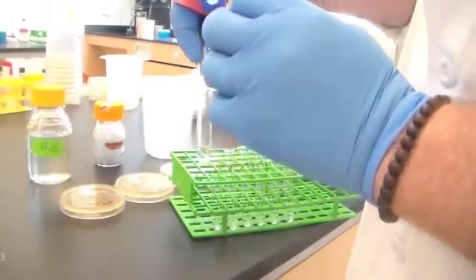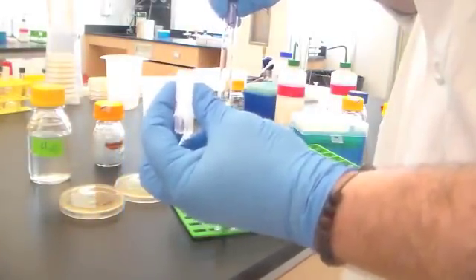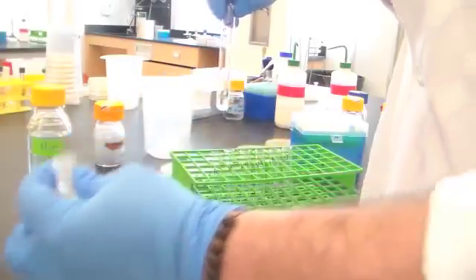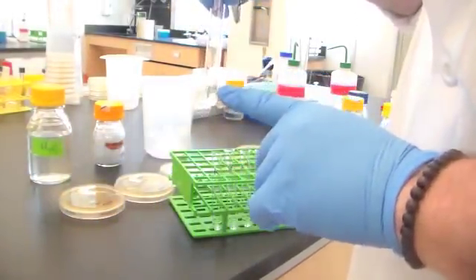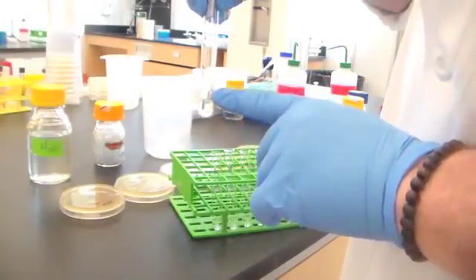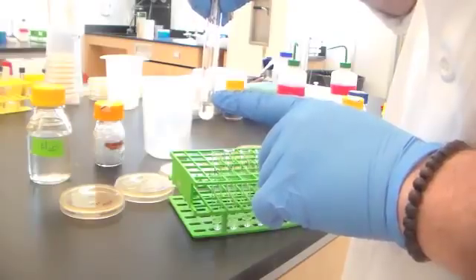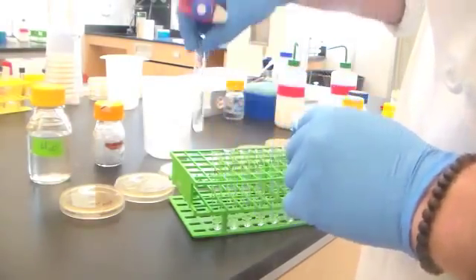Think about, visualize what you're doing. If, let's say for instance, there were 10 million bacteria per milliliter in that starting culture, and there are not, but if there were 10 million bacteria per mil in the starting culture, there are now 1 million per mil in this tube. It's a 1 to 10 or 10 to the minus 1 dilution. I've gotten rid of that pipette tip.